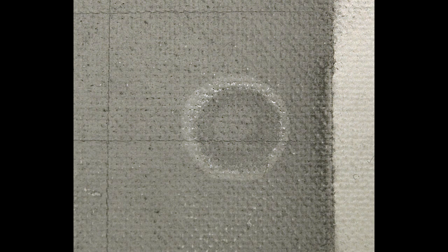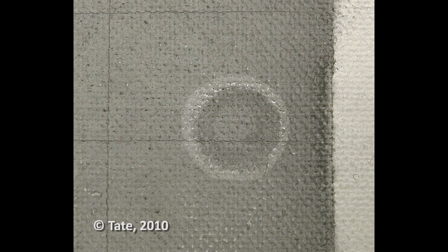In these images by Bronwyn Ormsby, we see why the large drop of water method of measuring the conductivity and pH of the paint surface can be problematic with acrylic paints. In the first image, we see a soiled titanium white paint film. In the second, we see the drop of water on that paint film. The drop of water picks up ionic and acidic components, but it also swells the acrylic paint surface. The third image is a surface after the water drop has been removed and the area gently blotted dry.